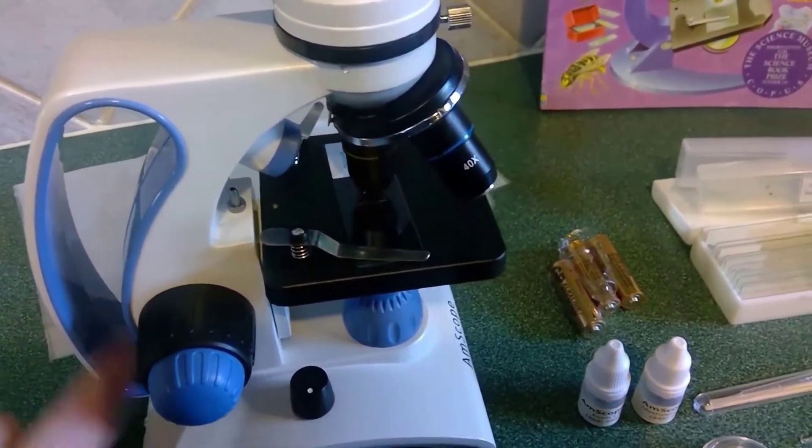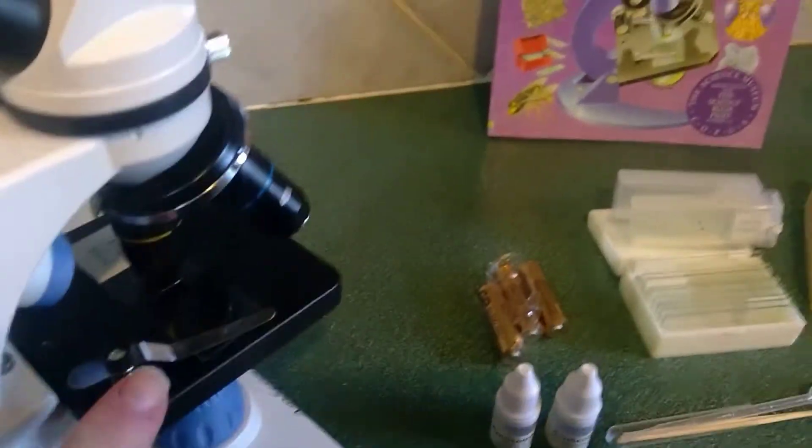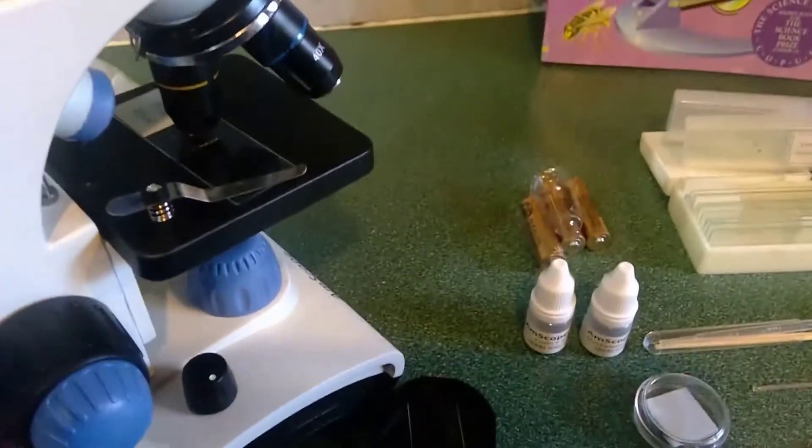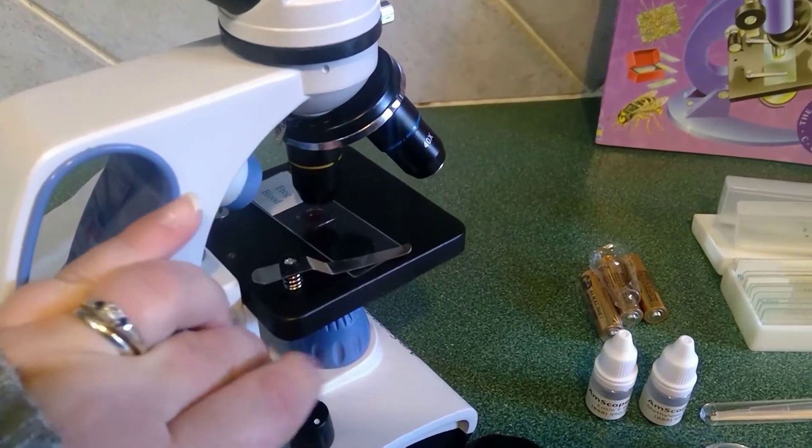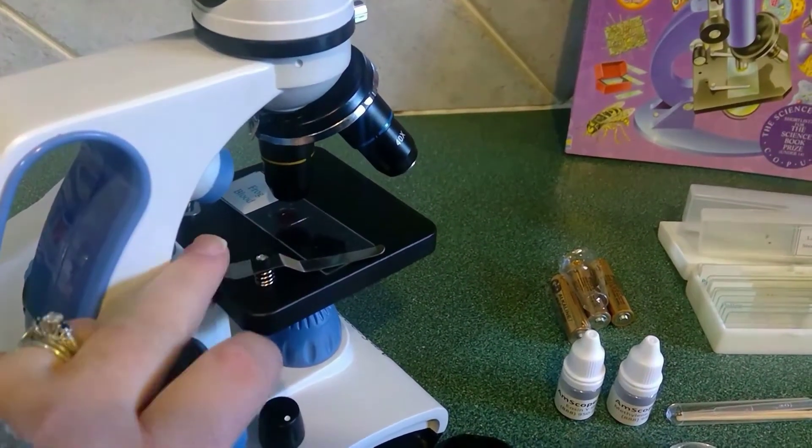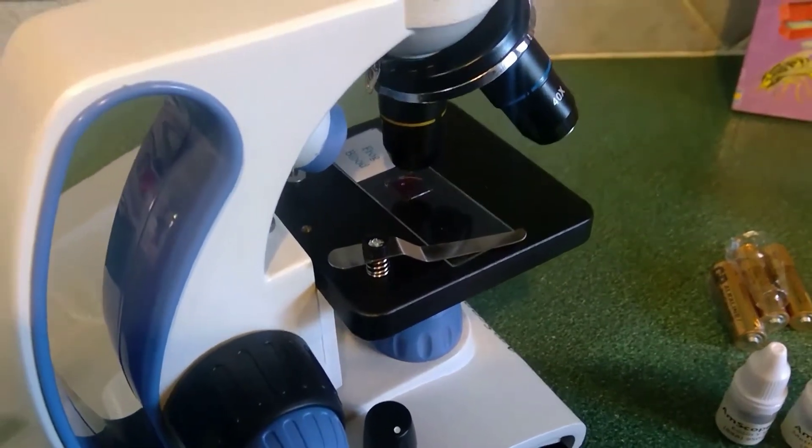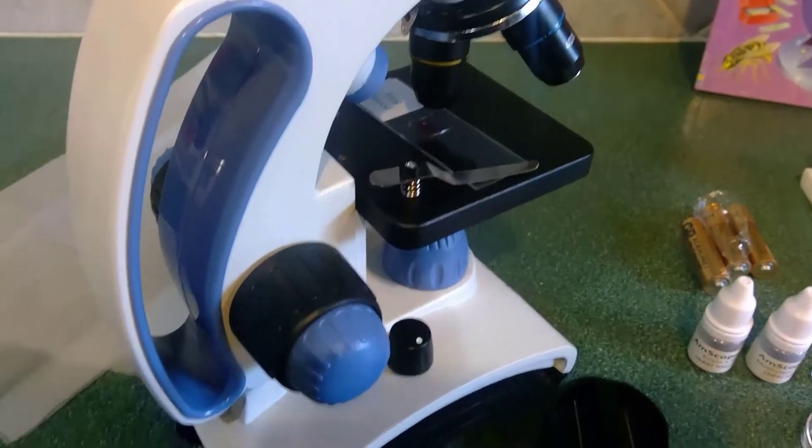It comes with the stage right here that moves up and down. It's got the prongs so that you can hold the slide. Right now, it's actually got frog blood on there. They got a kick out of seeing some of the slides yesterday that came with the microscope, and I'll show those.